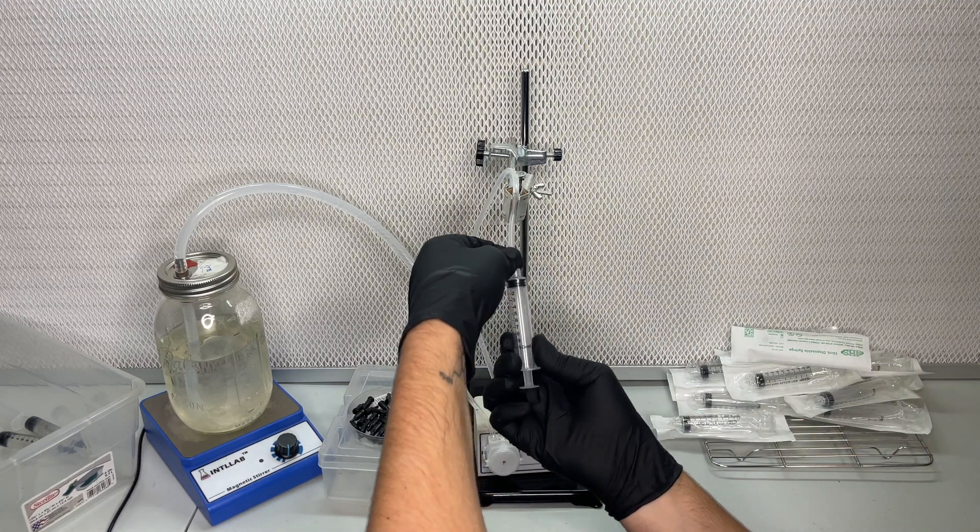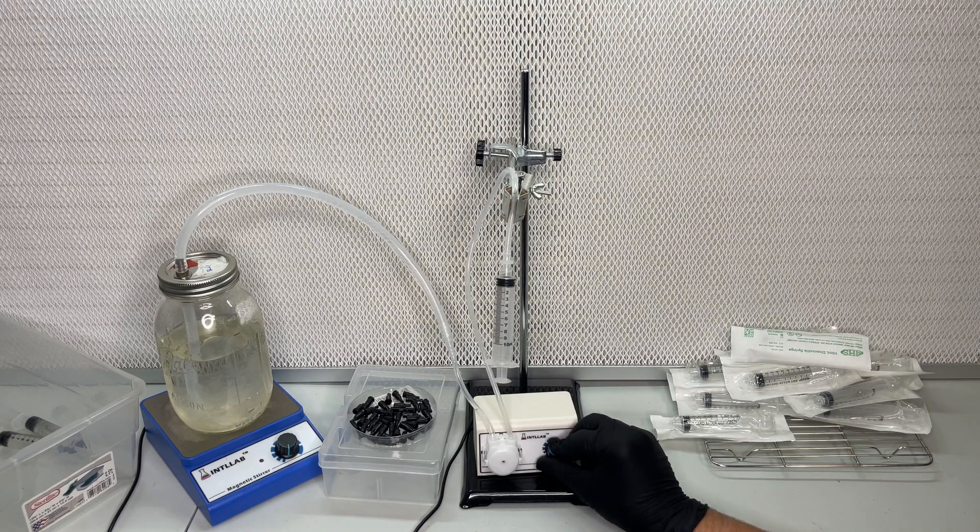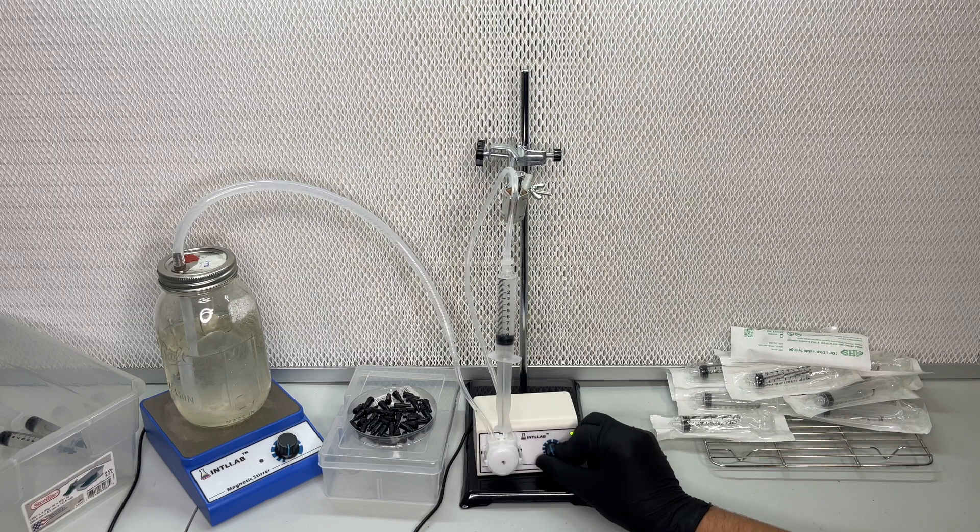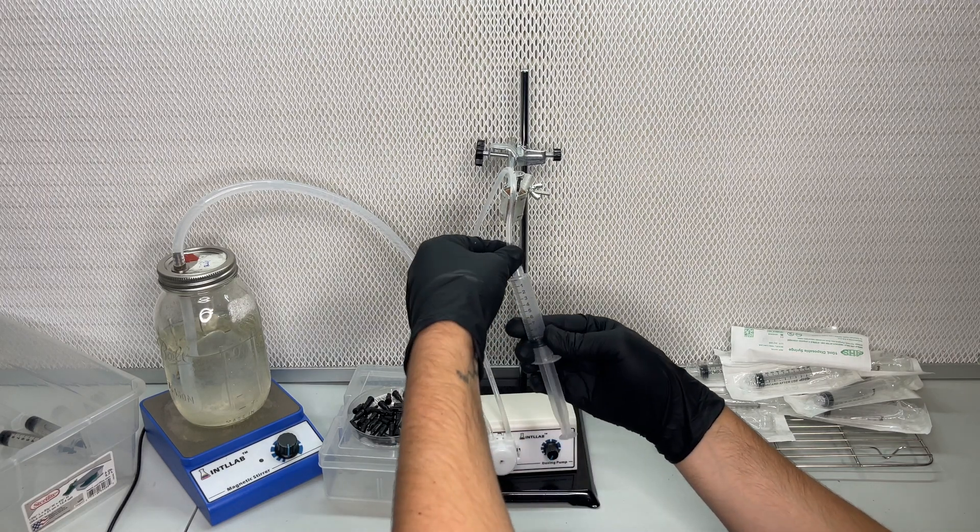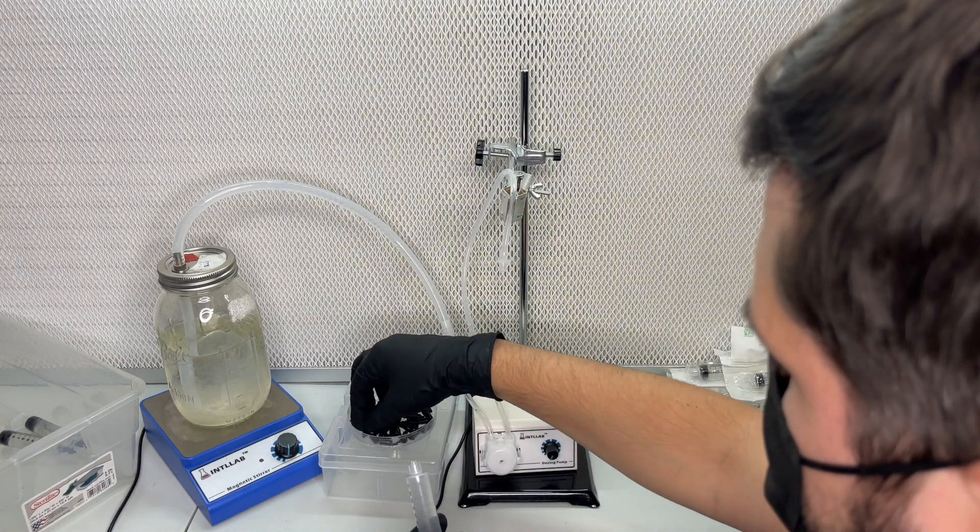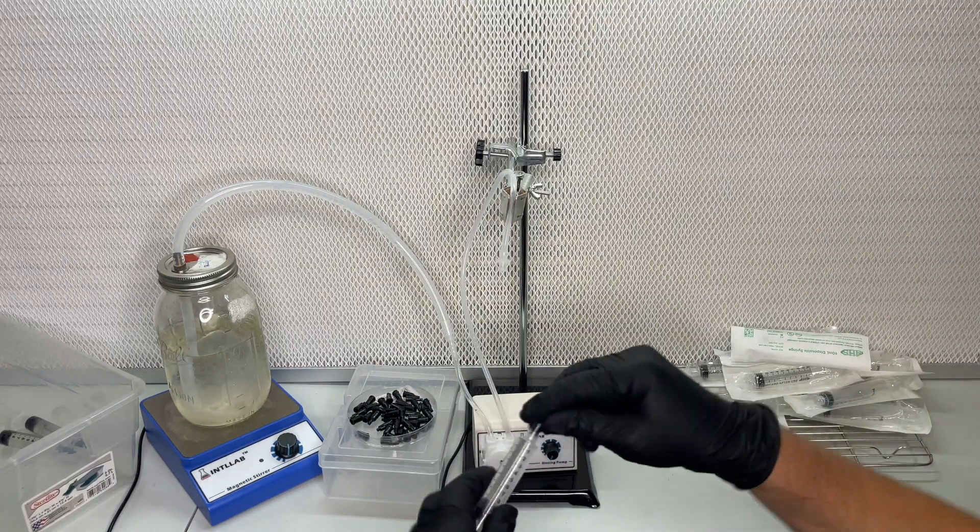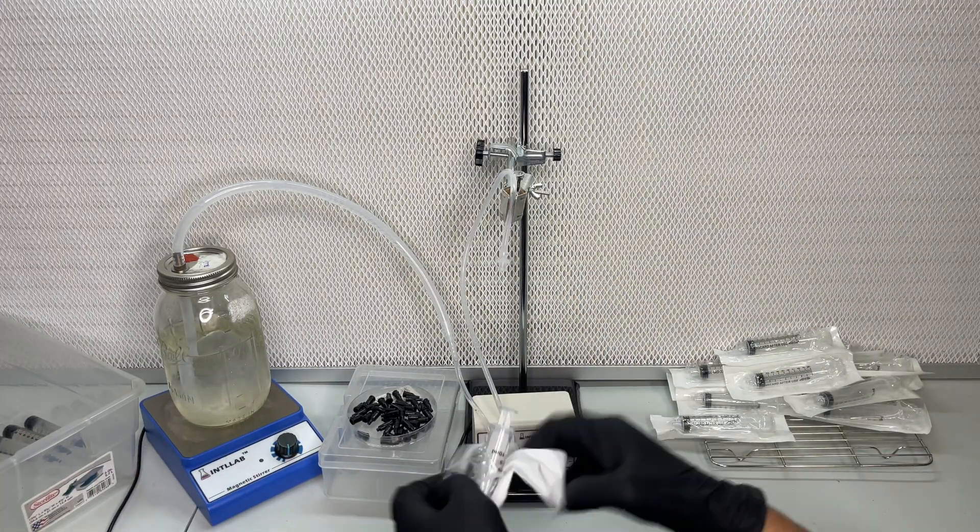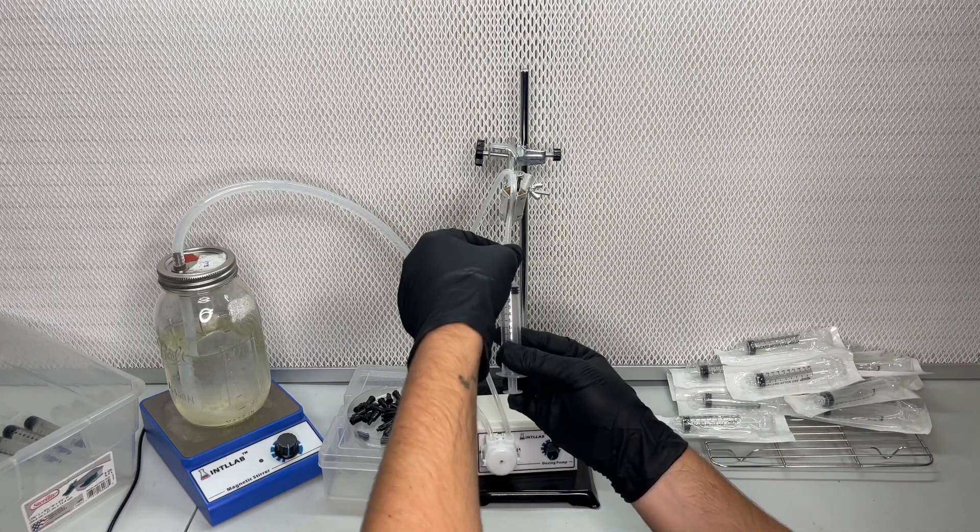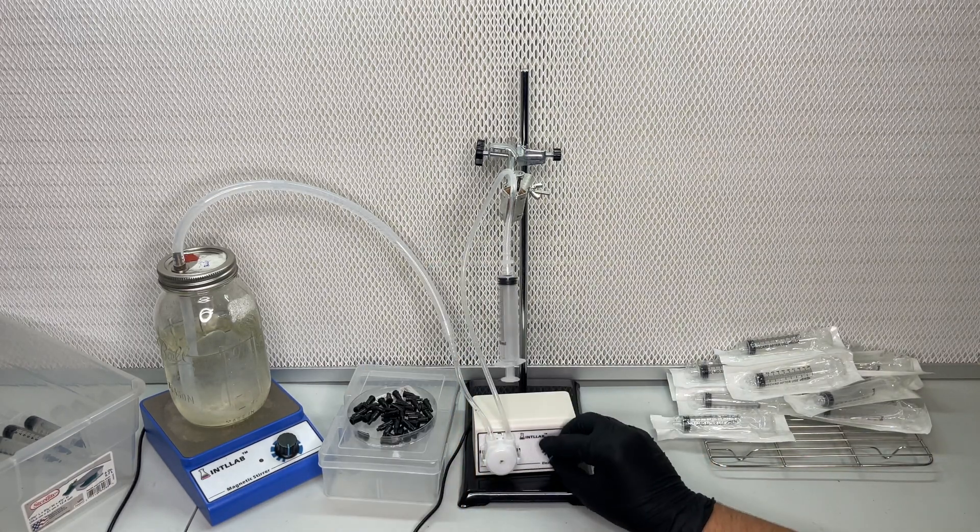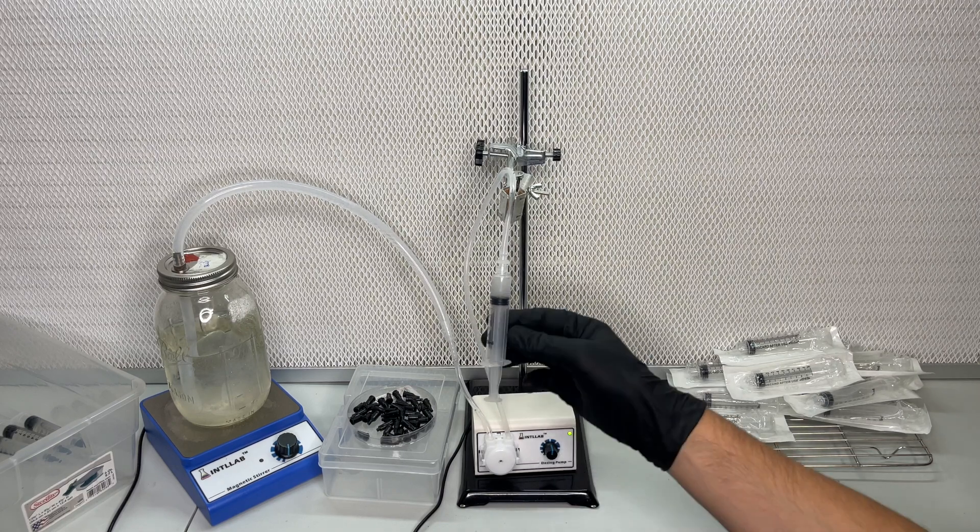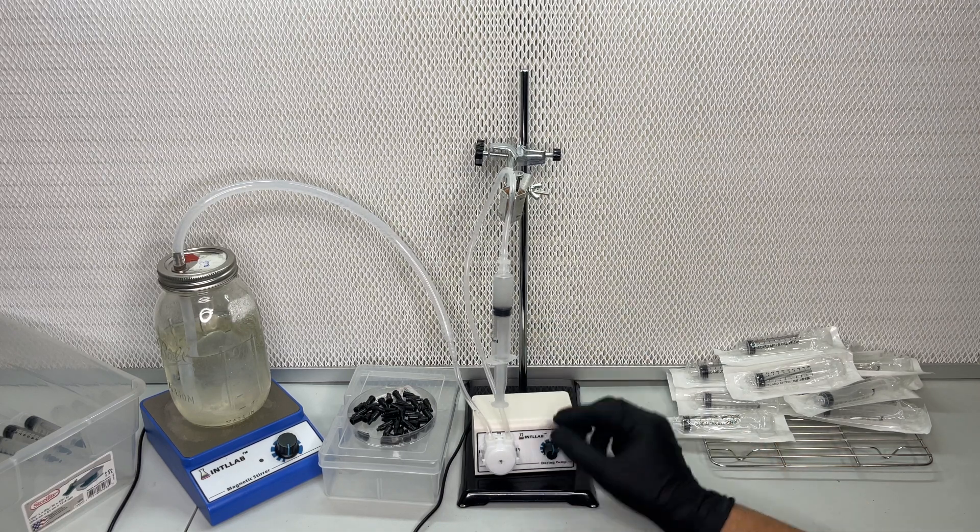With the tubing reaching all the way down to the bottom of the jar you can get every last bit of spore solution or liquid culture. You can use a magnetic stir bar while it's pumping to prevent any clogs in the tubing.